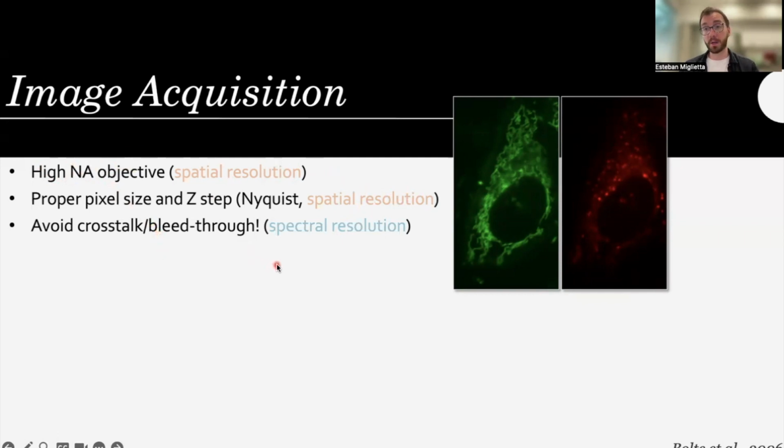Another thing, since we are using and comparing two different fluorophores, you need to have good spectral resolution, that is, to avoid any crosstalk or bleed-through of the signal from one channel to another.